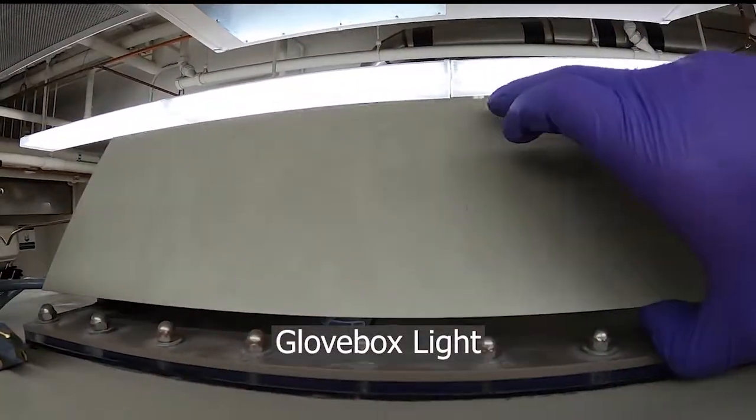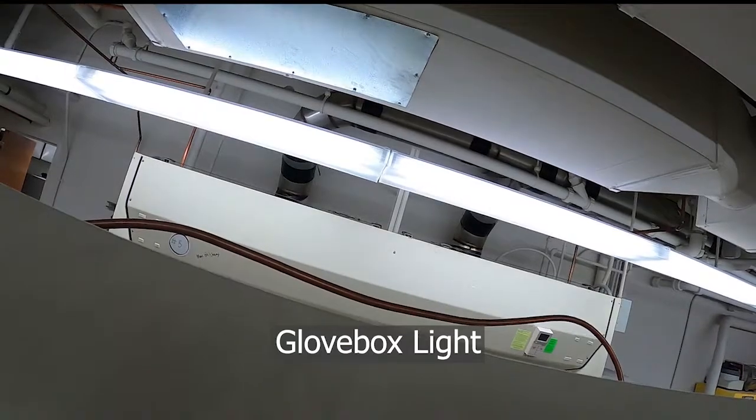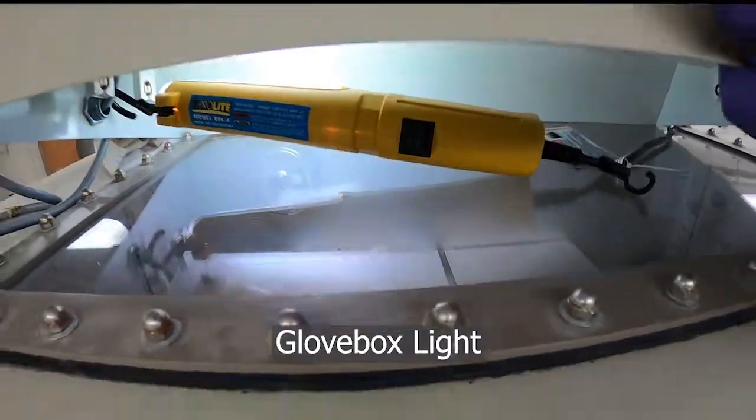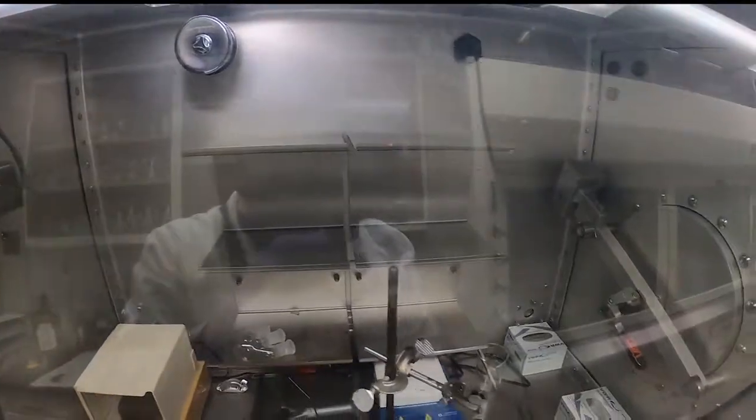There's a light up here under this metal box. With that switch there, you can turn it on. There's a plexiglass panel on the top so that it can shine through and light up the inside of the glove box.